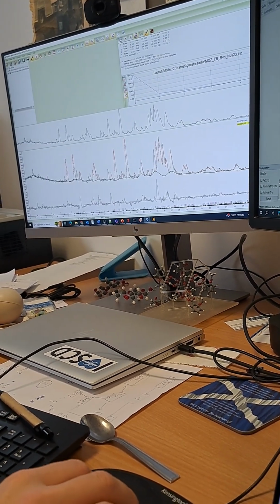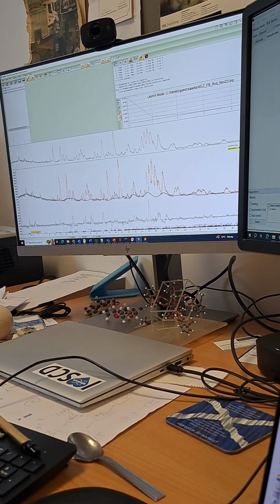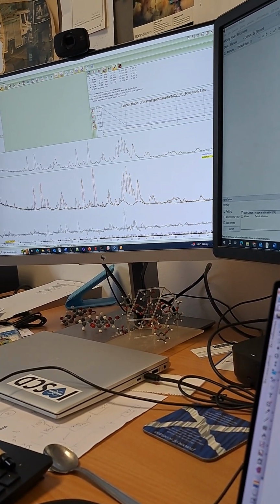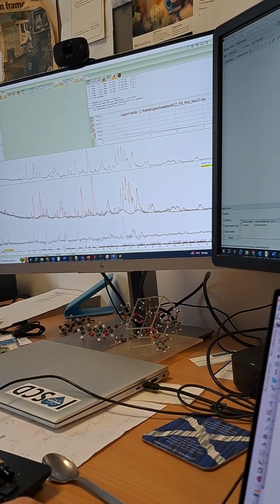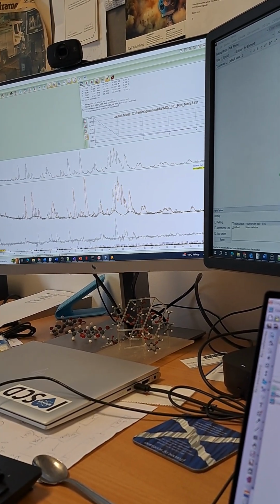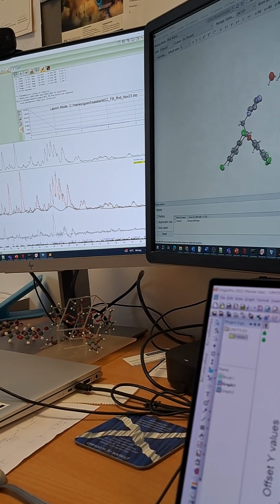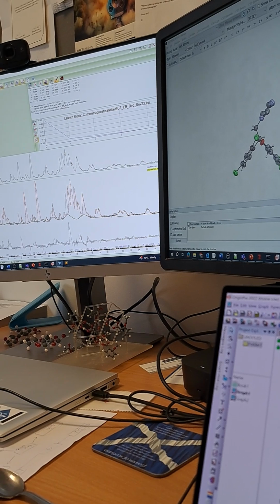Okay, so what I now need to do is manufacture this somehow. I need to change the cell parameters so that they better reflect the pattern I'm seeing. One way of doing this is to look at individual reflections and see which unit cell parameter contributes to each. Here, for example, is a great one: the 0, 2, 0. That's the B-axis, which is this way. So your B-axis is like this, and perpendicular to your B-axis is your beta angle.